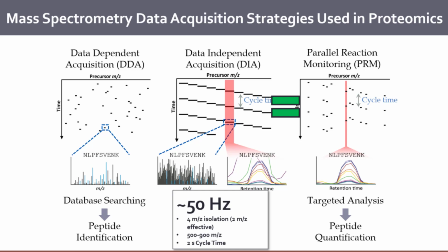And there are instruments being developed, we know, at Thermo Fisher, whether or not they'll make it to commercial, that are going at 60 to 70 hertz. They do sacrifice resolving power in the process. I will point out, though, that the precursor isolation is actually a little more important than the product ion resolution.